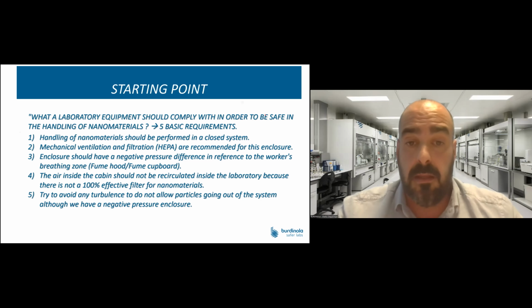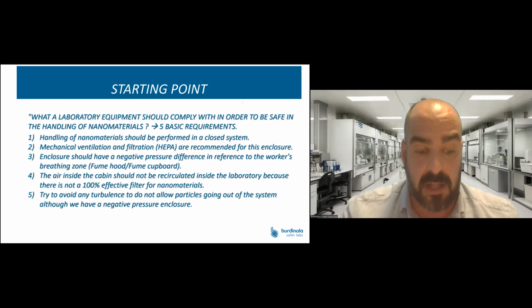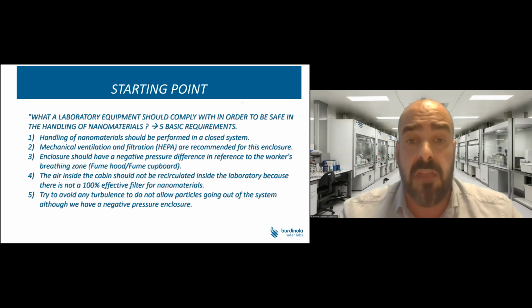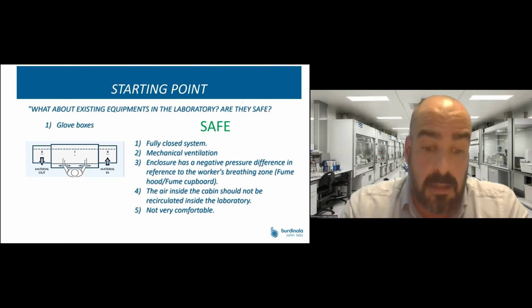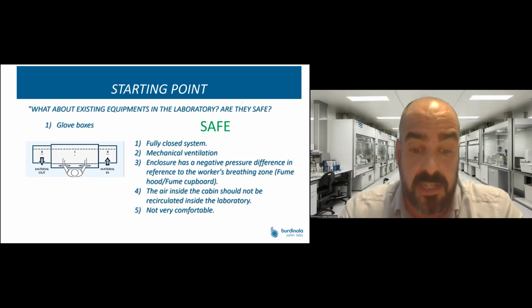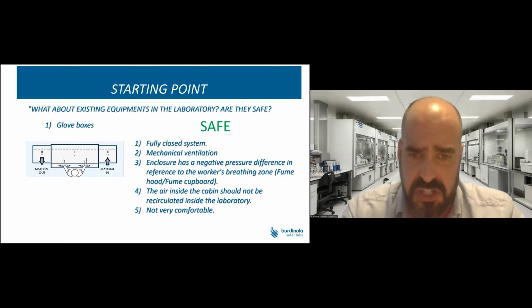So after that, we did a benchmark and analyzed the most used equipment in laboratories and checked if they complied with those requirements. First, glove boxes. They are safe since they comply with all requirements: fully closed system, mechanical ventilation, negative pressure.